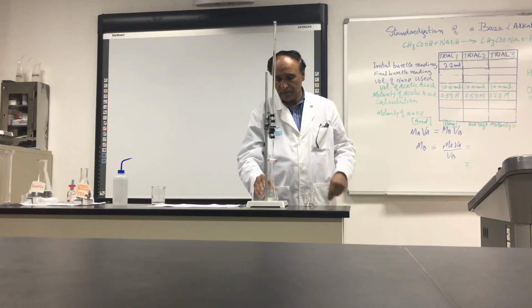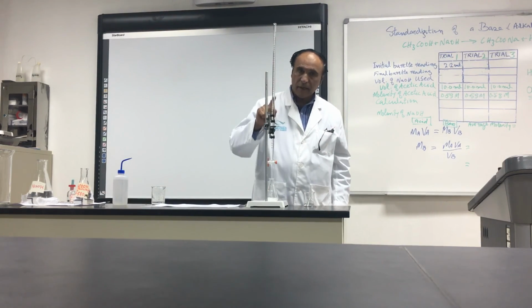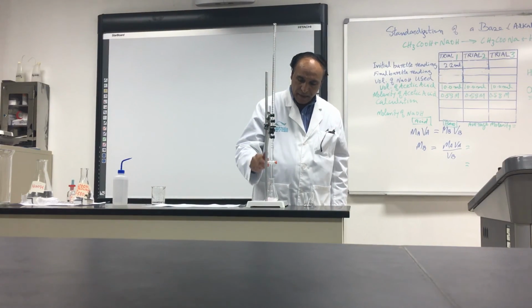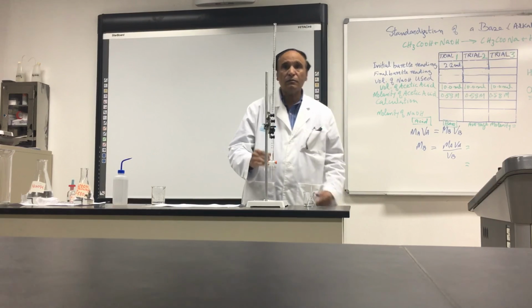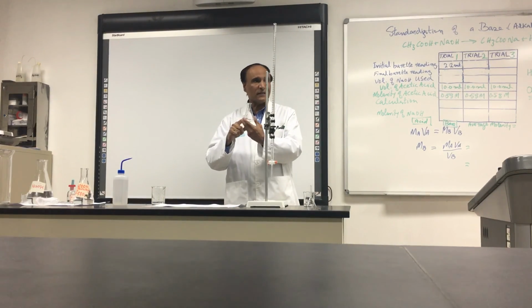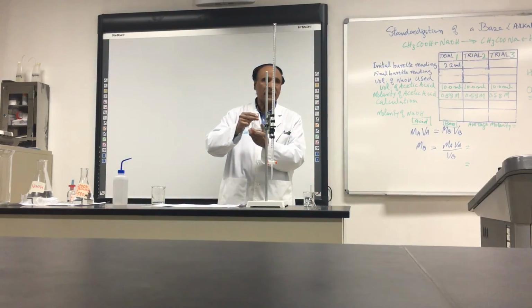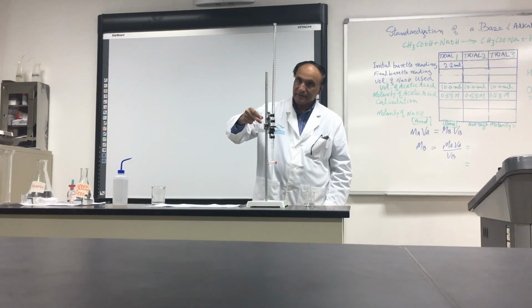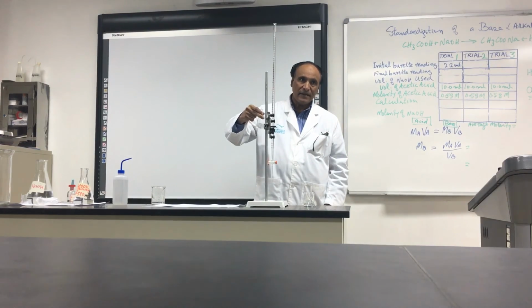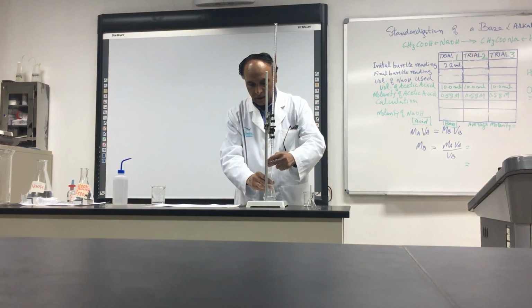In titration, we have to put this sodium hydroxide into that and a pink color comes. We have to shake the flask. Don't shake it like this. Hold the flask from the neck with 3 fingers, with 3 fingers, and shake it like that. Right? Also hold it with 3 fingers and control it.